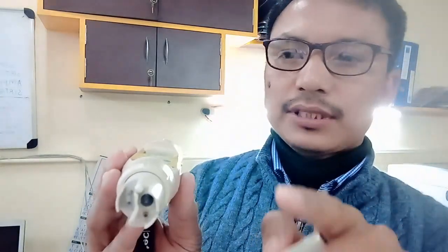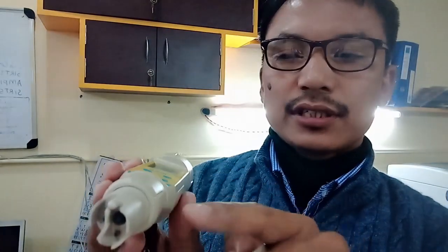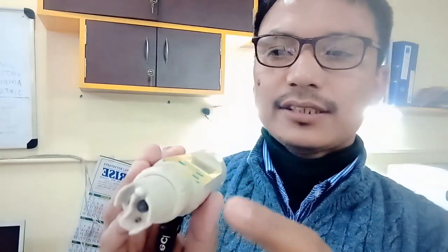Say if you are using the pH button, this will get the pH. As you know, pH means the hydrogen ion concentration. It will measure the hydrogen ion concentration from the water. So you will get the reading here, and you can easily note it down. And there is no need of standardizing this one. It is auto standardized, and you can use it directly in the water.